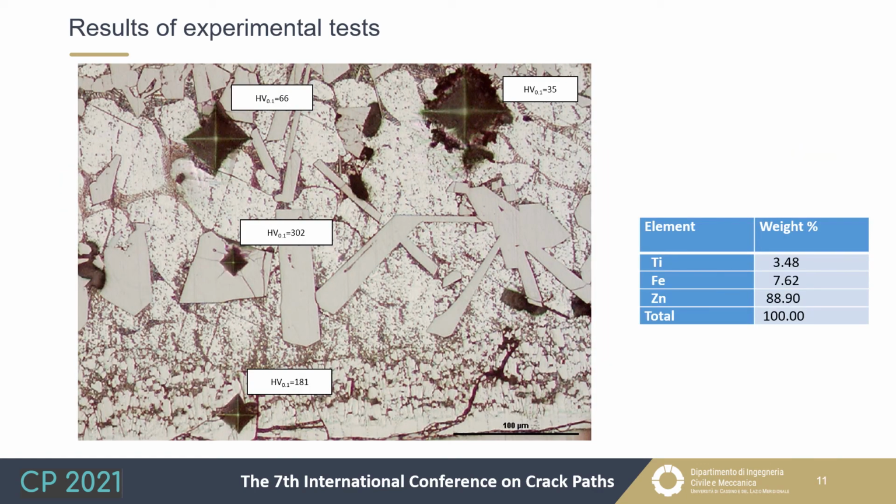This is due to the brittle behavior of the tau phase. We can see an indentation of the tau phase obtained by a traditional micro hardness machine, and the value of the Vickers micro hardness is very high, comparable to the micro hardness of quenched steels. You can see the brittle behavior due to the presence of a secondary crack starting from the indentation, like this.